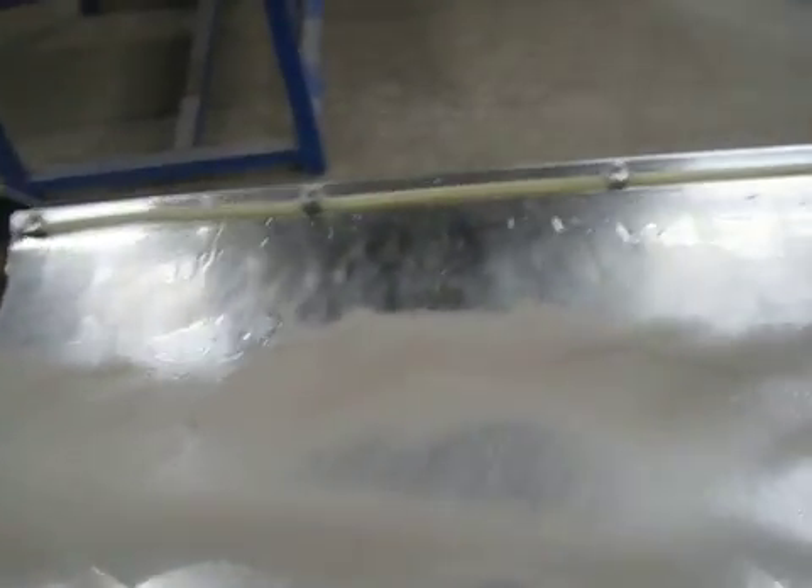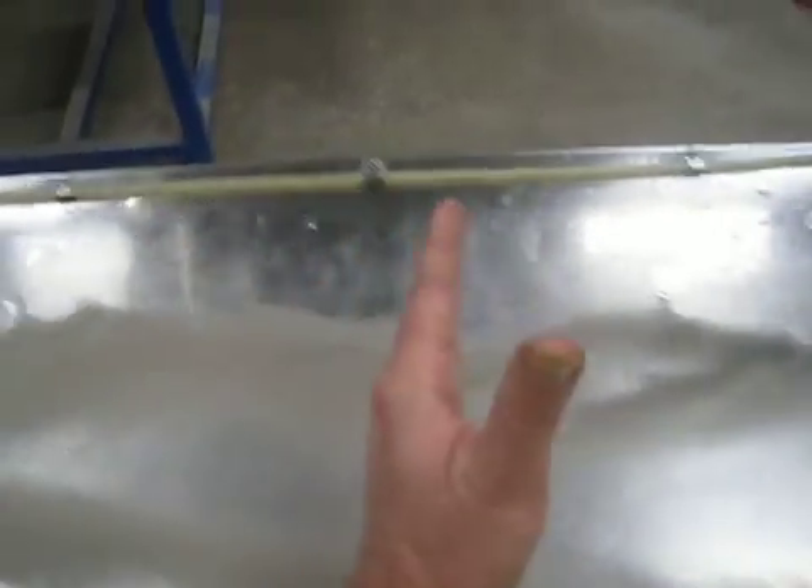We can now section the sample and make our cuts.